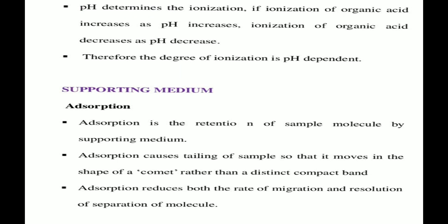Now the next factor that affects electrophoresis, that is pH.